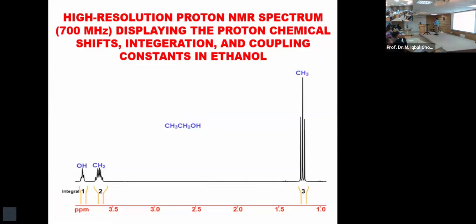You get three most important pieces of information in it. You get the total number of protons. You get which type of proton exists. And you must be asking me, why proton? Why am I using proton, right? Because hydrogen is proton. Nothing else.